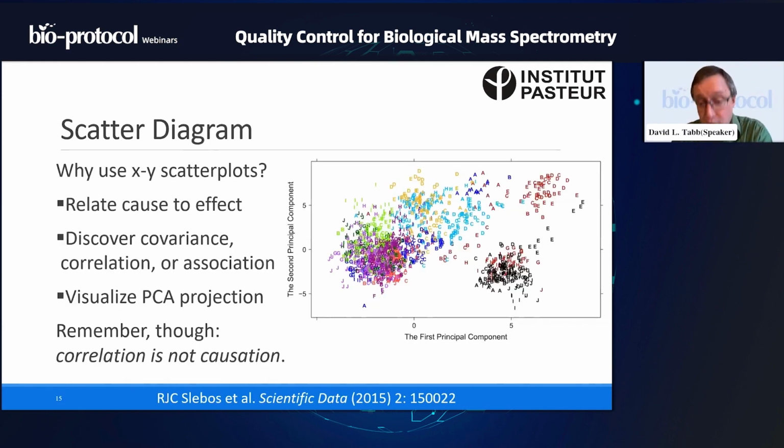Scatter diagrams are certainly very, very useful. Certainly with spreadsheets and languages like R, they've gotten a whole lot simpler to work with as well. And so for this, I wanted to give an example of an XY scatter plot in the context of quality control. In this case, Vanderbilt University was taking part in the CPTAC network, analyzing a whole bunch of colon tumor samples. We had, let me remember this correctly, 15 fractions for each of 95 samples. It was a lot of data, took us 8 months of time on the instrument.